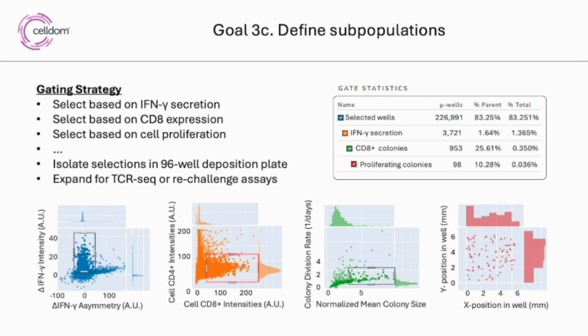We have followed the tried and true method of developing gating software that looks like a flow cytometer. However, there are a few key differences that are worth noting. First of all, our data points are actually microwells instead of cells, and therefore they have more complicated data types. For example, a microwell may have different initial conditions, say a co-culture versus a monoculture, and it may even be more granular, like there are 2 cells of type A and 1 cell of type B. Similarly, microwells also have parameters related to secretion of certain cytokines, which also occur at different time points.